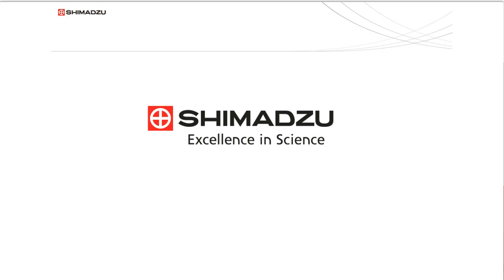Now, the modifier can also change not only the resolution, but your peak shape. So if you are running, say, an acidic compound with, let's say, acetic acid, just for purposes of this question, and maybe you're not getting a good peak shape, or you're seeing a lot of tailing, switching to a different acidic modifier may increase not only the resolution, but sharpen your peaks.